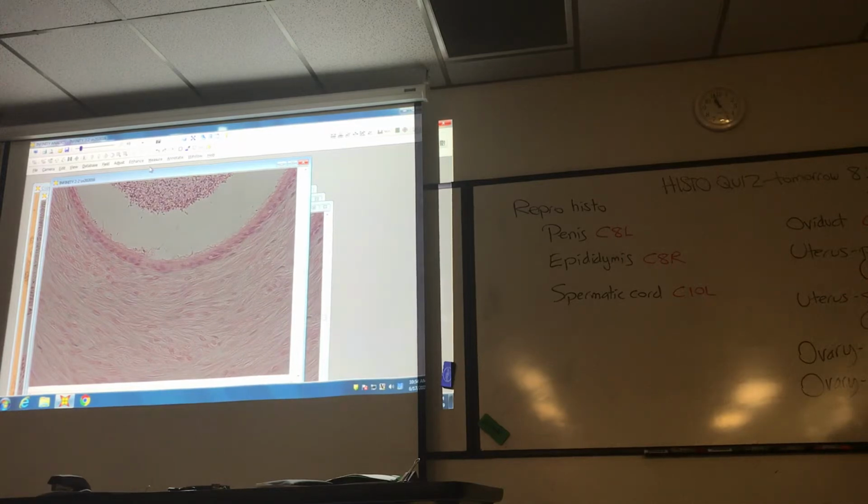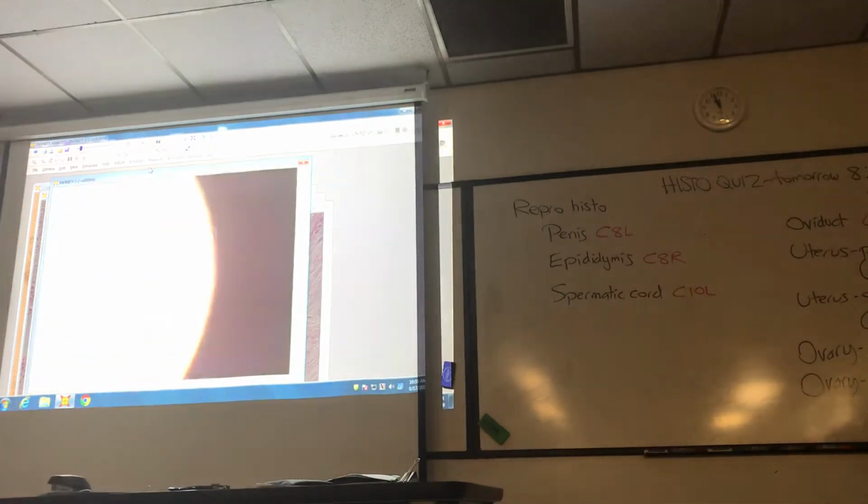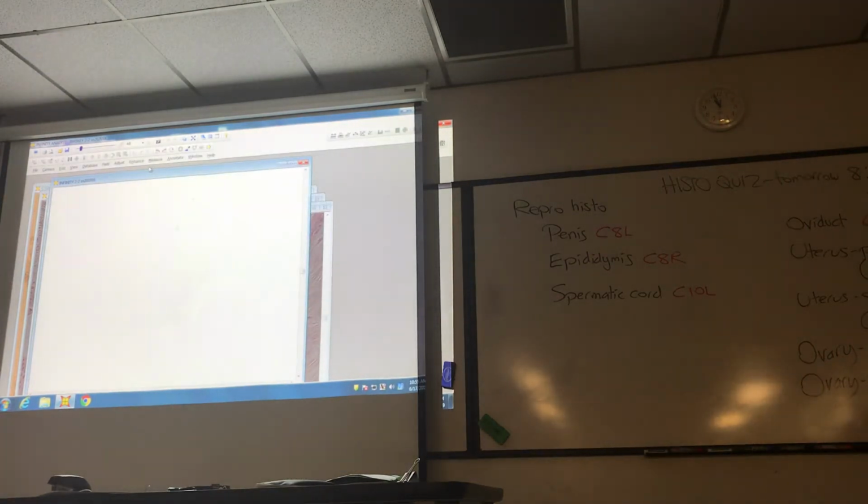I'm switching genders. I'm going to the female biological sex. And let's go to the oviduct or uterine tube.